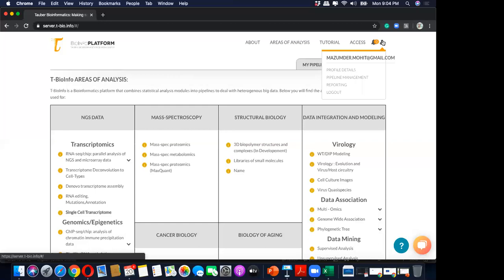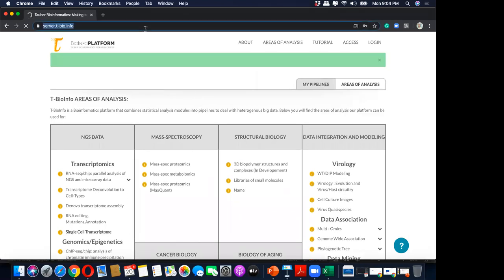Here you can see I have already logged in, so I'll log out, and if you open this URL, okay, there's a good question.